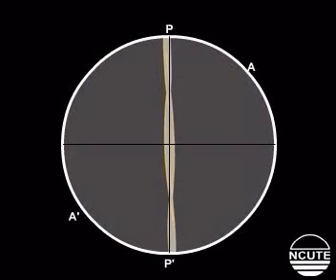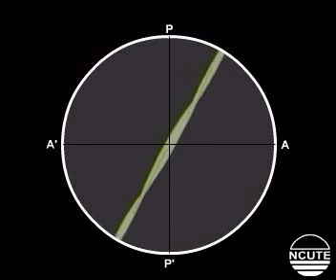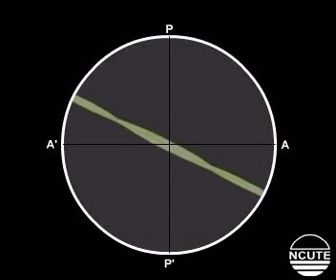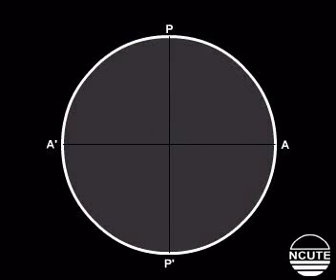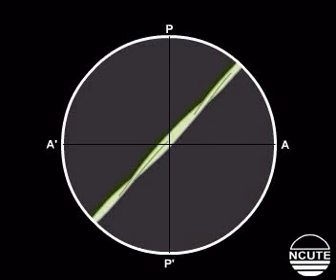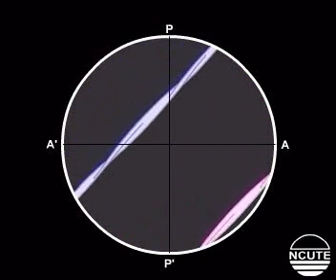Now let us rotate the analyzer to have a crossed polars view. Notice that the fiber is now invisible. Now rotate the stage of the microscope so that the fiber is at 45 degrees to PP or AA. Notice that the fiber begins to become visible, and at 45 degrees it is brightly colored due to the interference effect. Note also that there are two perpendicular extinction positions and two perpendicular positions of bright fiber when the fiber is rotated. Lastly, take a good look at how this principle is used to differentiate between mature cotton fiber, half mature cotton fiber, and immature cotton fiber.